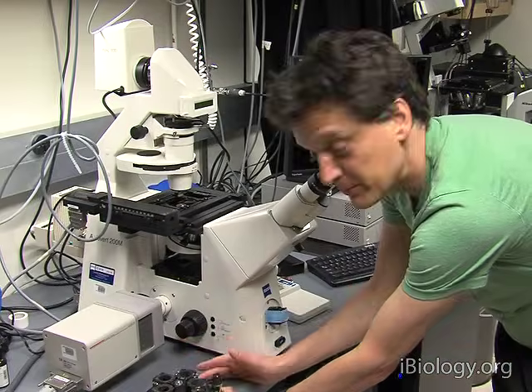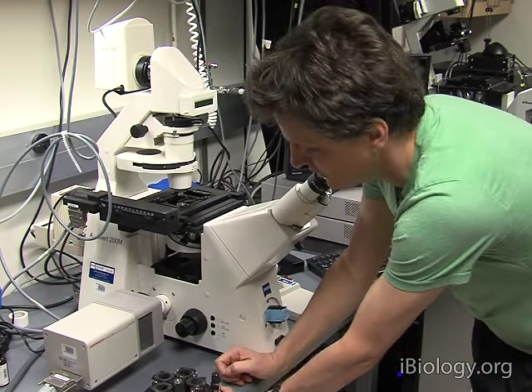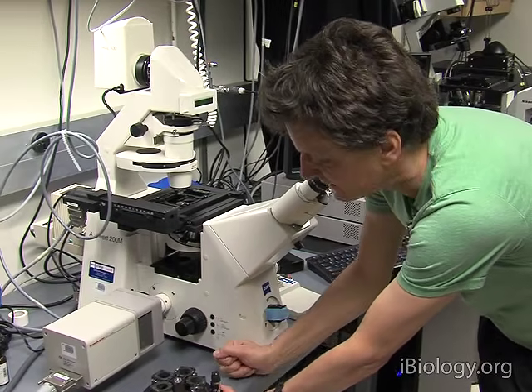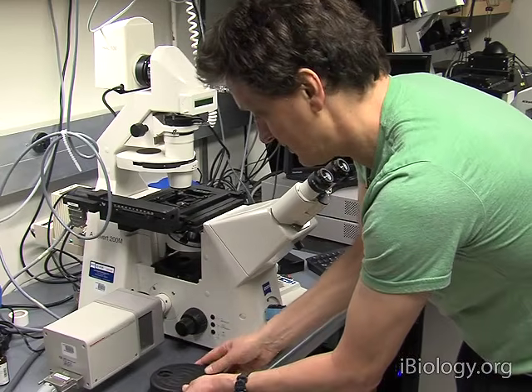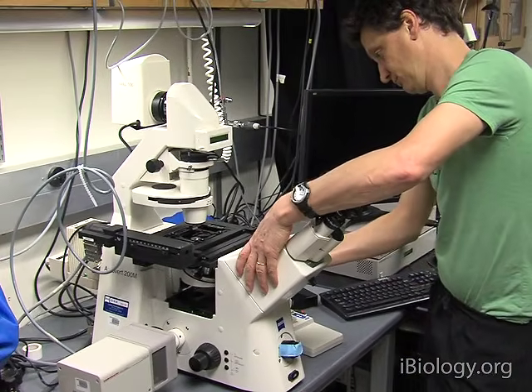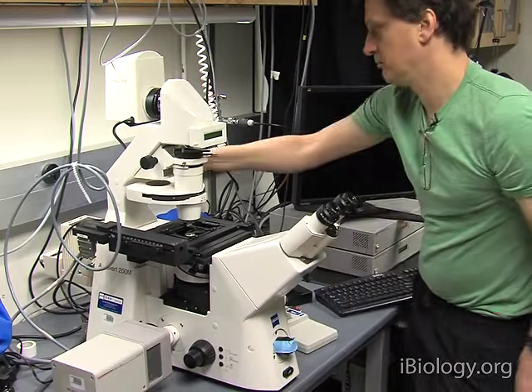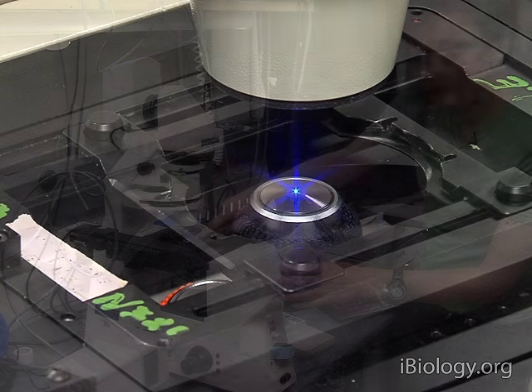And these cubes have been selected to visualize the dyes that we're interested in. And so usually there's one for things like DAPI, for things like GFP or fluorescein, and a cube for something like mCherry or rhodamine. Okay? So when I now put this back into the microscope, and then open the shutter here in the back that blocks the light at the moment, we get blue light coming out of the objective.